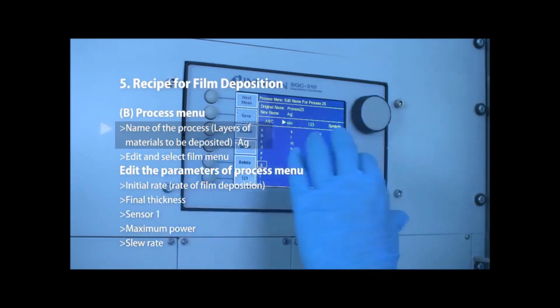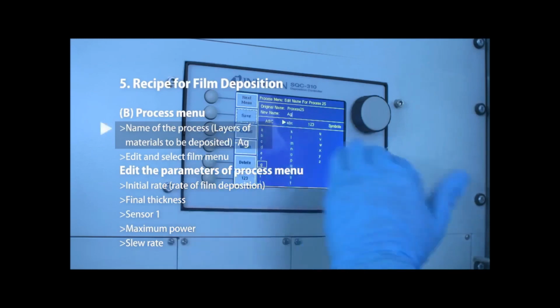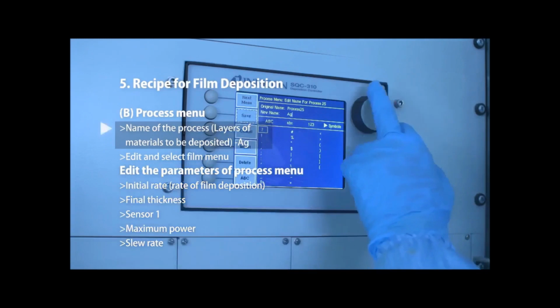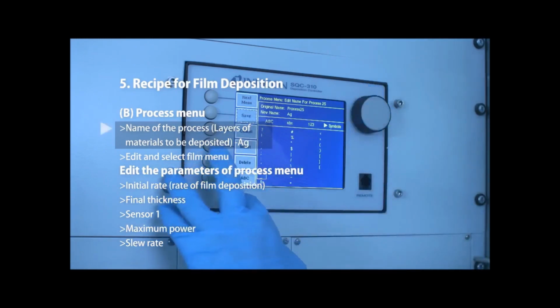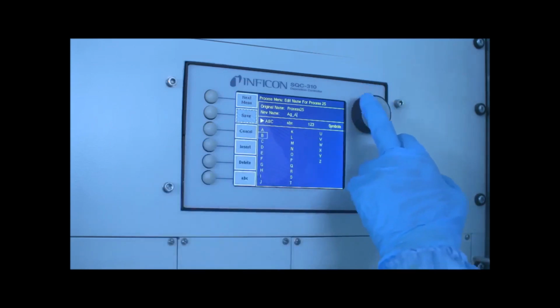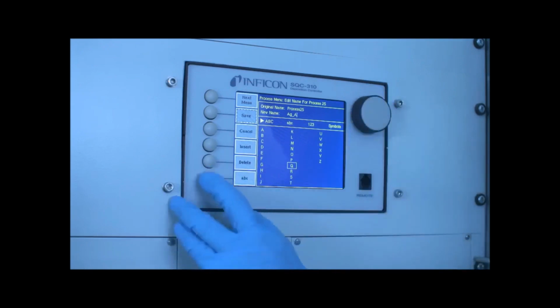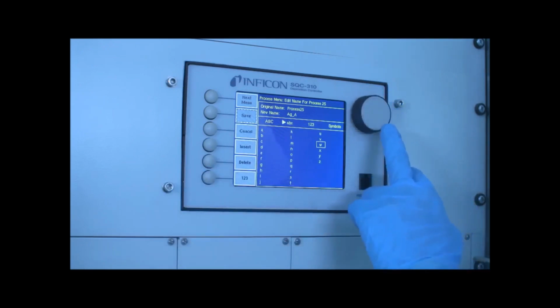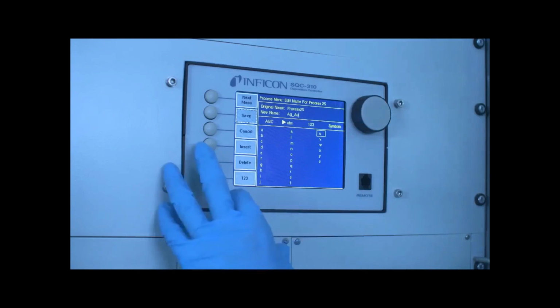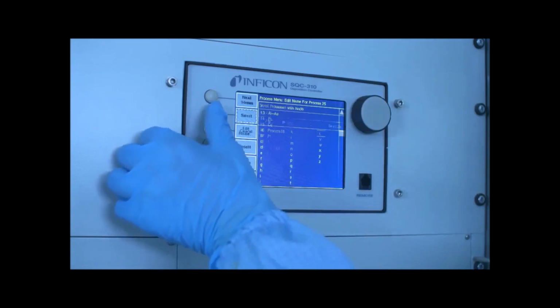But if we want to deposit multiple films like silver and gold, then we have to put another name for gold here also. Right now in our case we are going to deposit silver only, so we are going to put AG only. Let's save the name.